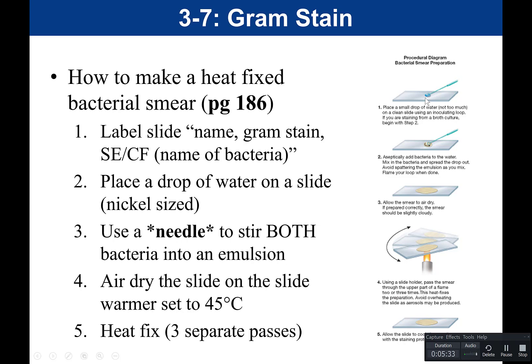Work quickly because you don't want the water to dry out. One question in your question sets asked what is wrong with the heat-fix procedure on page 186. The problem is the book says to use a loop to transfer bacteria, but you want to use a needle so that you don't pick up too much bacteria. The loop was only used to place water on the slide.